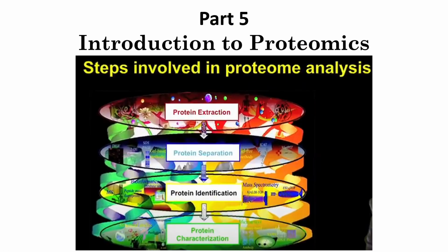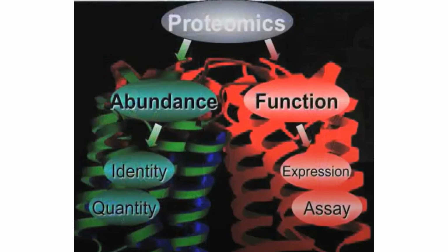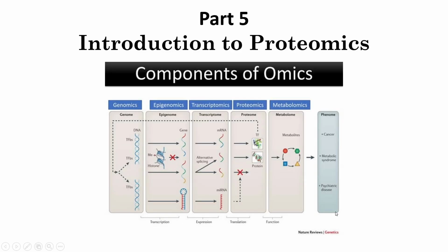And a bit of introduction to proteomics. Proteomics is nothing but the study of everything about the protein itself. It can be depending upon the abundance, identity, quantity, or if you want to study expression and assay based, depending upon that, your technique will change.